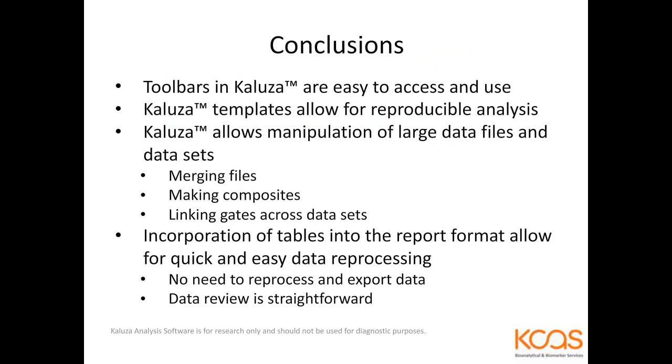All right, so my conclusions. I'm going to wrap this up. The toolbars in Kaluza, as you saw, I could do things like get the wheel with all of the tools. That's a simple right-click on any plot or box. They're easy to access. They're pretty intuitive.